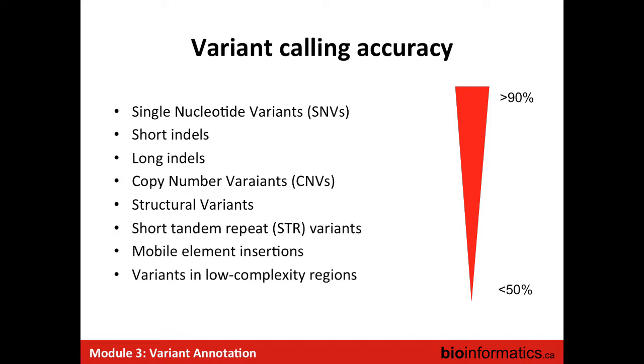The other approach is things like the 10x, where you have information about long fragments and then still do the short read. These are, I think, still in research and exploration mode. People try to calculate the ideal read length that is not as expensive as a long read, but not as problematic as a short read. 150 is too short, but I don't need a 10K read. But yeah, it's a good question.